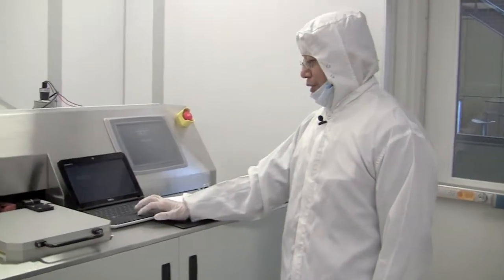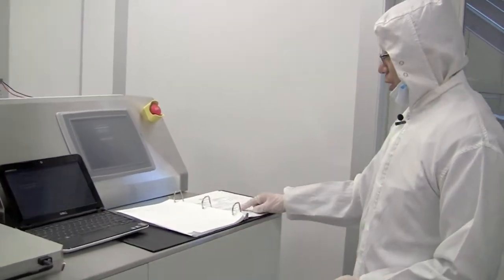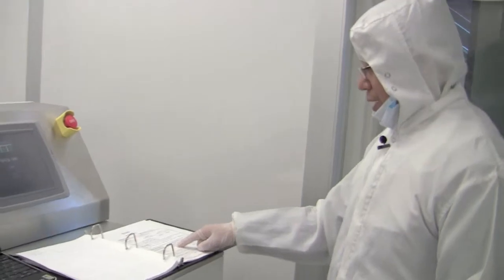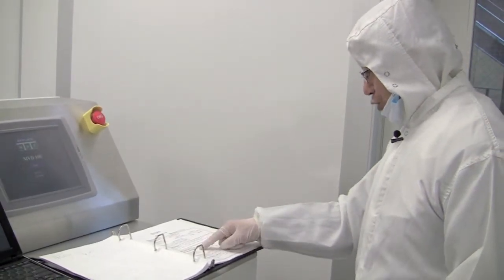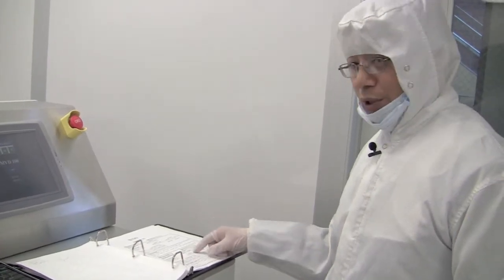We will give you the introduction of nanoimprint in a different video. So this is the logging computer. Before we log into this computer, we should read the log sheet first to check the base pressure and the flow rate. If there are no issues from the former user, we can then log into this computer.